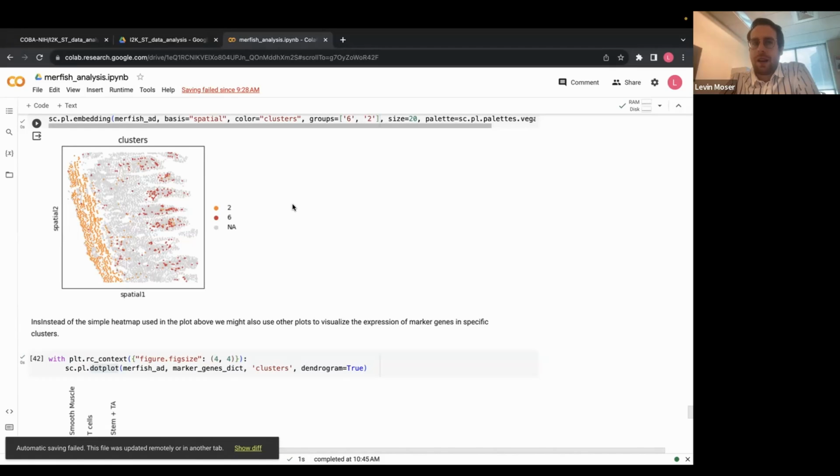There is no standard in terms of open source, partially because most researchers are probably using the vendor software that comes with the device. Unfortunately, there's no software that I'm aware of that helps with that.